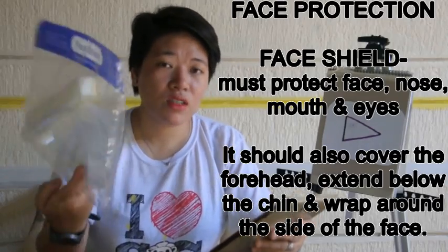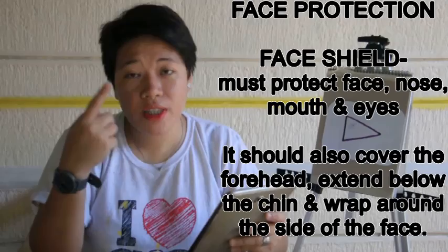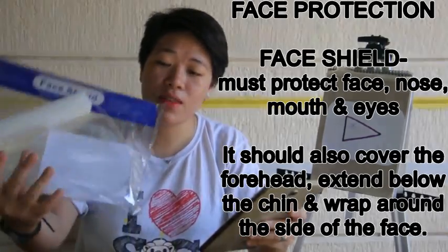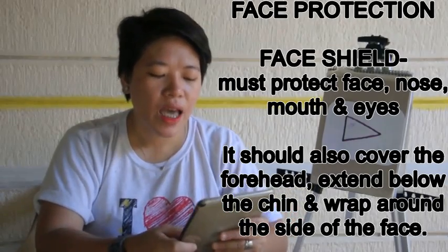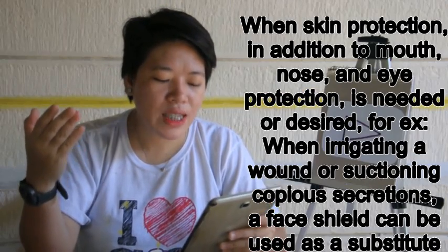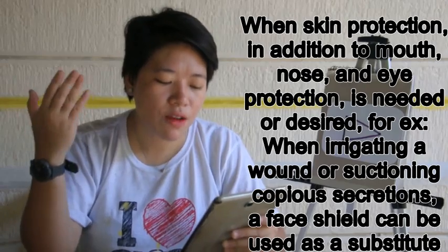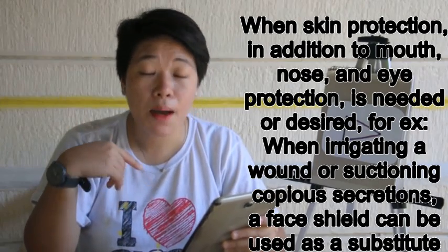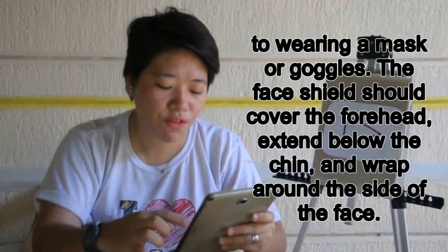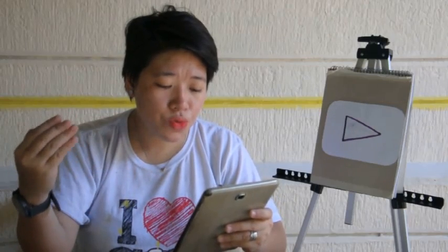So face shields, or like this face shield, the purpose of this one is to protect our face, to protect our nose, our mouth, and eyes. So this also should cover the forehead. So we have something here to cover our forehead, extend below the chin, and wrap around the side of the face. When skin protection in addition to mouth, nose, and eye protection is desired, for example, when irrigating a wound or suctioning copious secretions, a face shield can be used as a substitute to wearing a mask or goggles. The face shield should cover the forehead, extend below the chin, and wrap around the side of the face. So, yun nga, sabi dito, para maging substitute, to substitute wearing a mask.